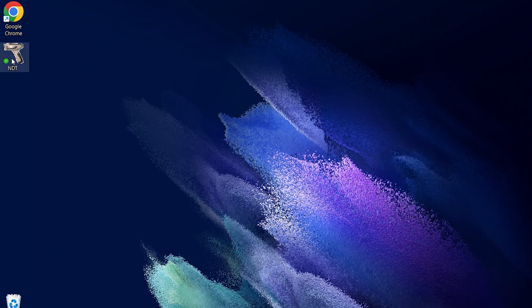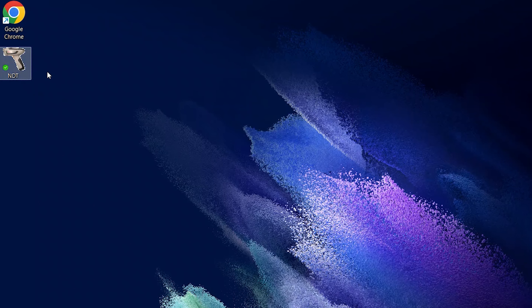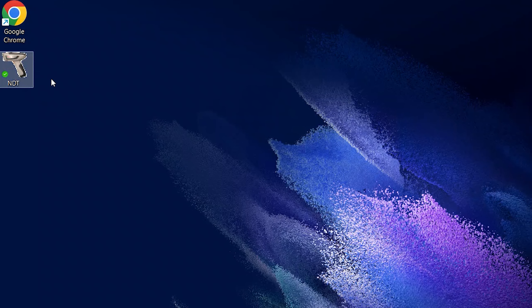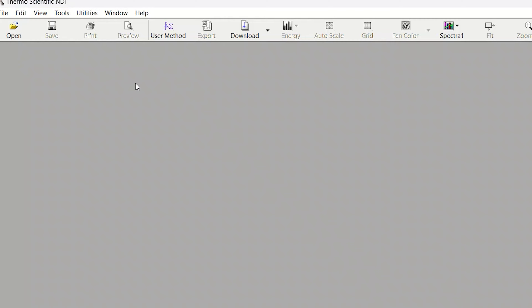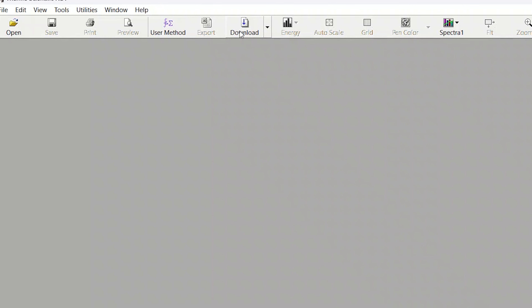The next thing we're going to do is go onto the computer. We don't actually have to do anything with our Niton XL2 once it's plugged in — I don't have to tell the unit I want to export the data. We're going right to the computer. What we want to find is this NDT software program — not NDTR, but NDT — and it looks like a little gray gun for an icon.